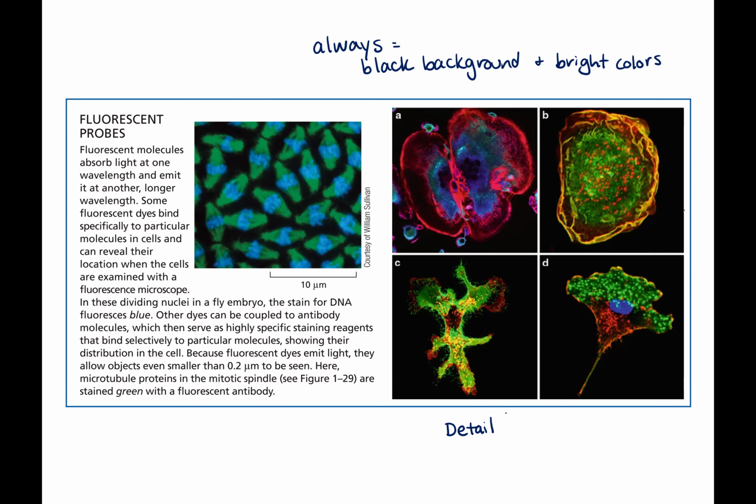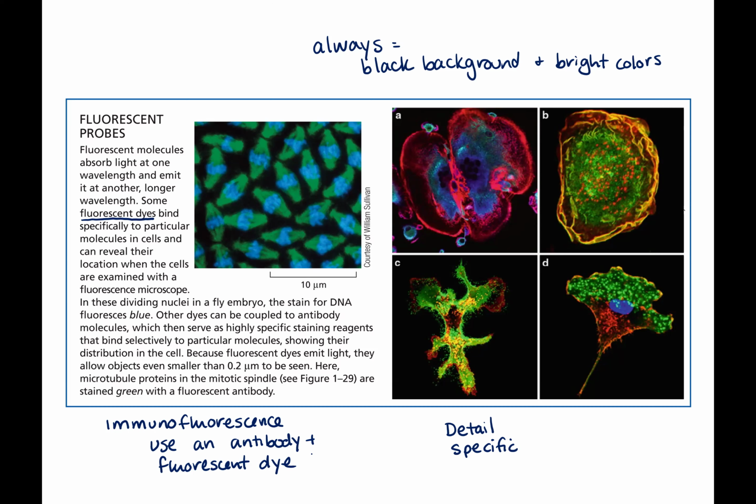Or we will also talk about immunofluorescence. And that's where we use an antibody plus a fluorescent dye to stain the cells, stain the molecules, identify the molecules. So just a heads up, this semester, anytime you see immuno, that word, it means we're using an antibody.